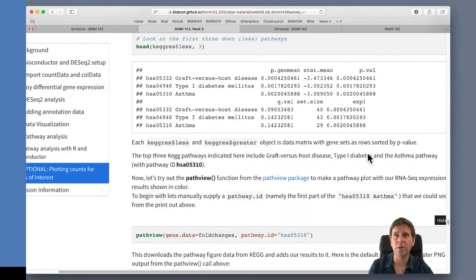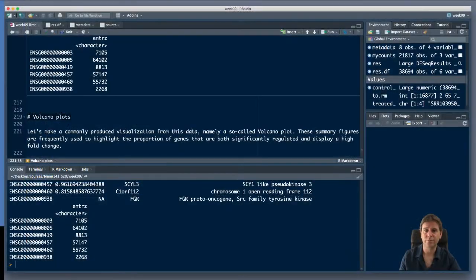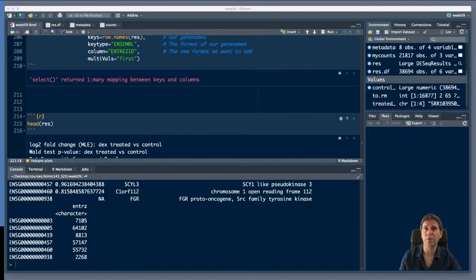So here we are back in RStudio, checking if we've fixed our problem. Looks like we've got everything we need here. Let's run here to here, so I'm able to get ahead of it.